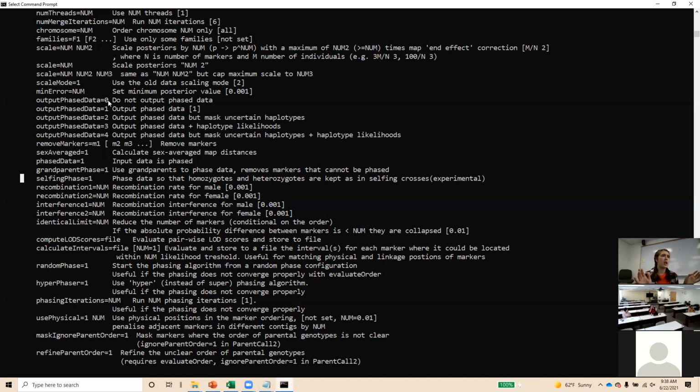I'll remove all the markers that I no longer want to include in linkage mapping. I'll delete those out. Where did you open that file? Tassel? You can open it in Tassel. I technically do it in R, but you kind of have to know how to manipulate those files. You can actually just open it up in Excel if you want to. I thought it's too big to see, right? Most likely, yeah. As long as you've filtered it in Tassel and you're below maybe 5,000 or 6,000 markers, you can open it in Excel.